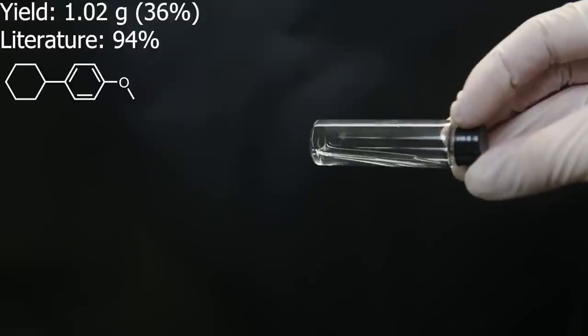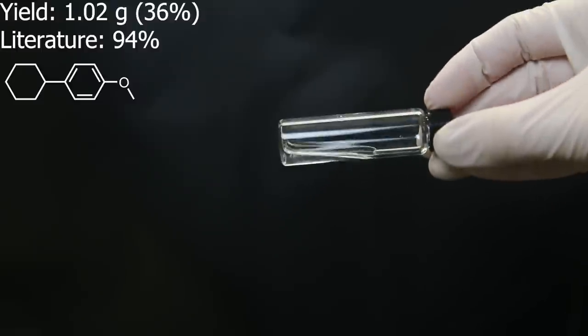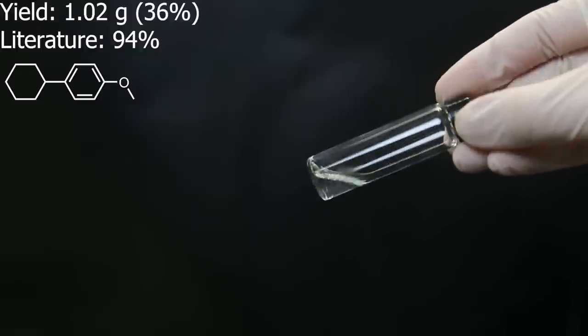Anyhow, the yield is quite a bit lower than the literature, so it is possible that my LED setup was just trash, and I also didn't do it in an inert atmosphere like them.